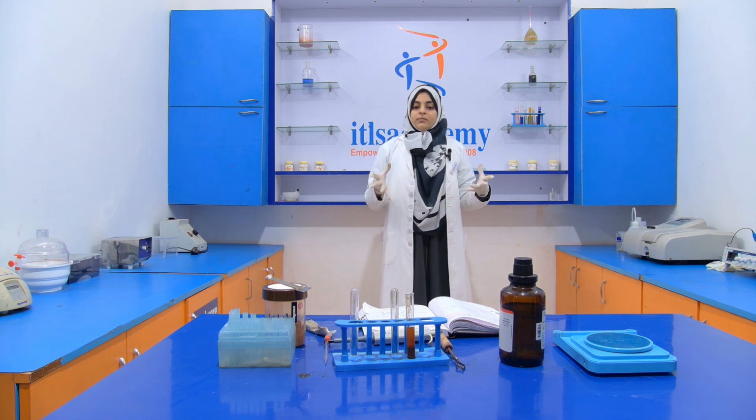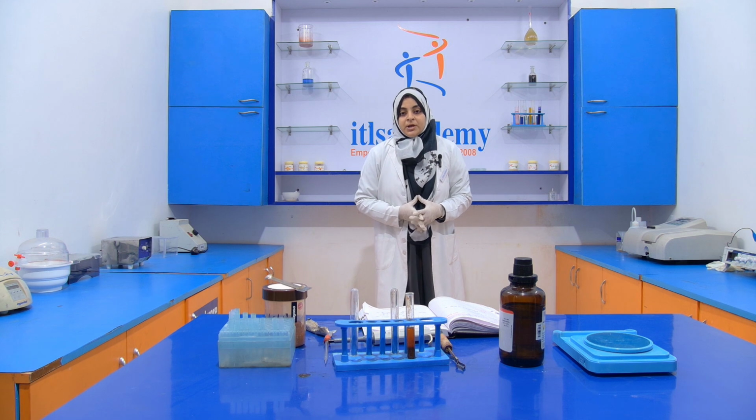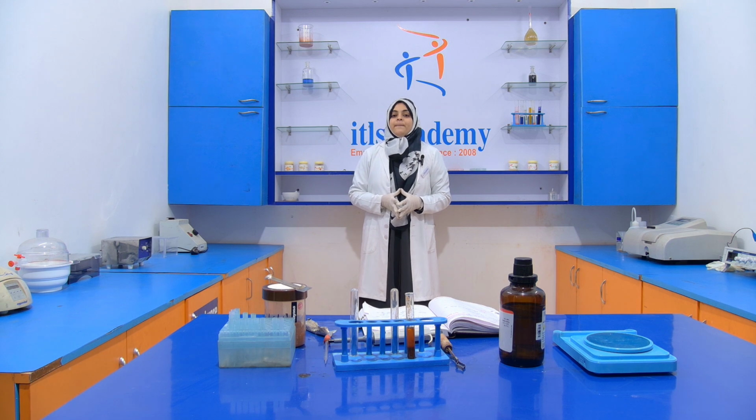Okay, so this is about the detection of rhodamine B in red chili powder, and we get a positive result, which means that our sample contains rhodamine B. So I hope you will understand.